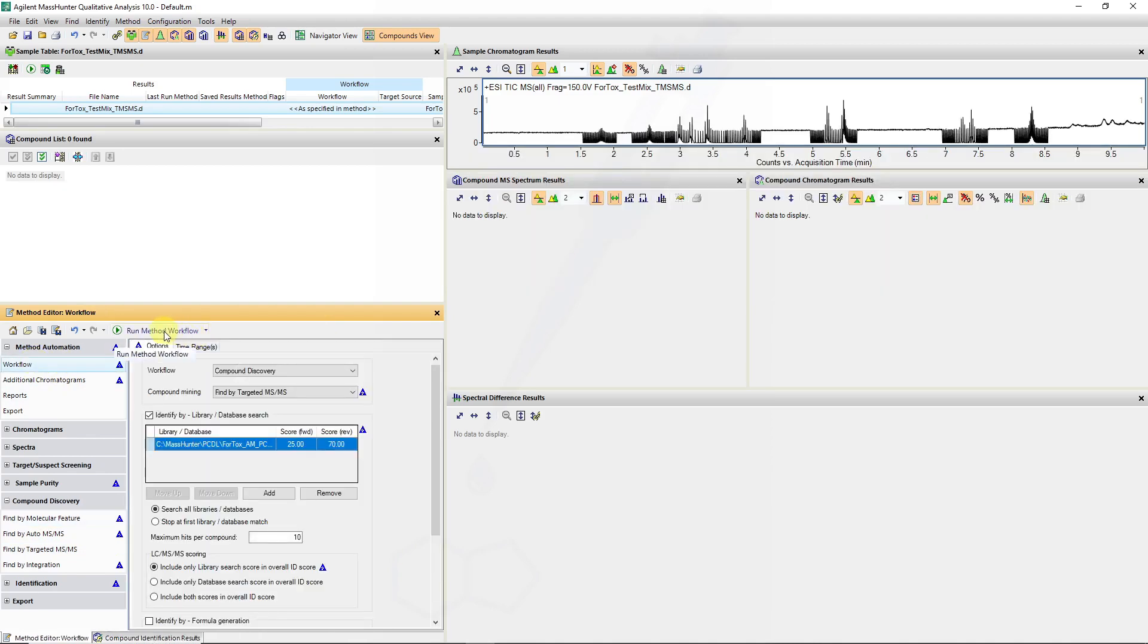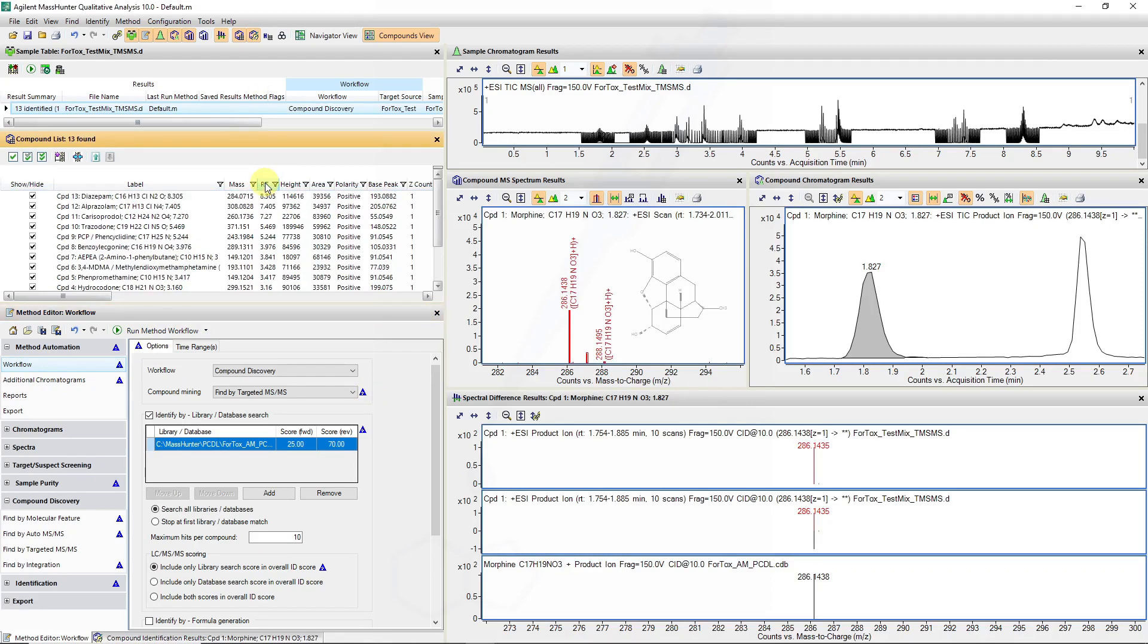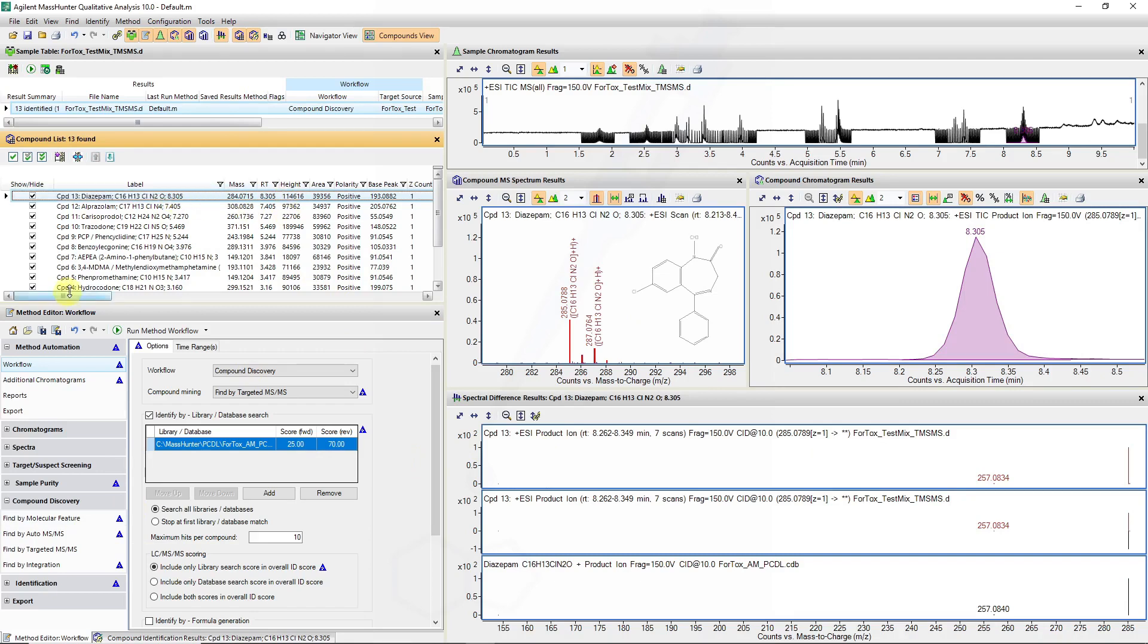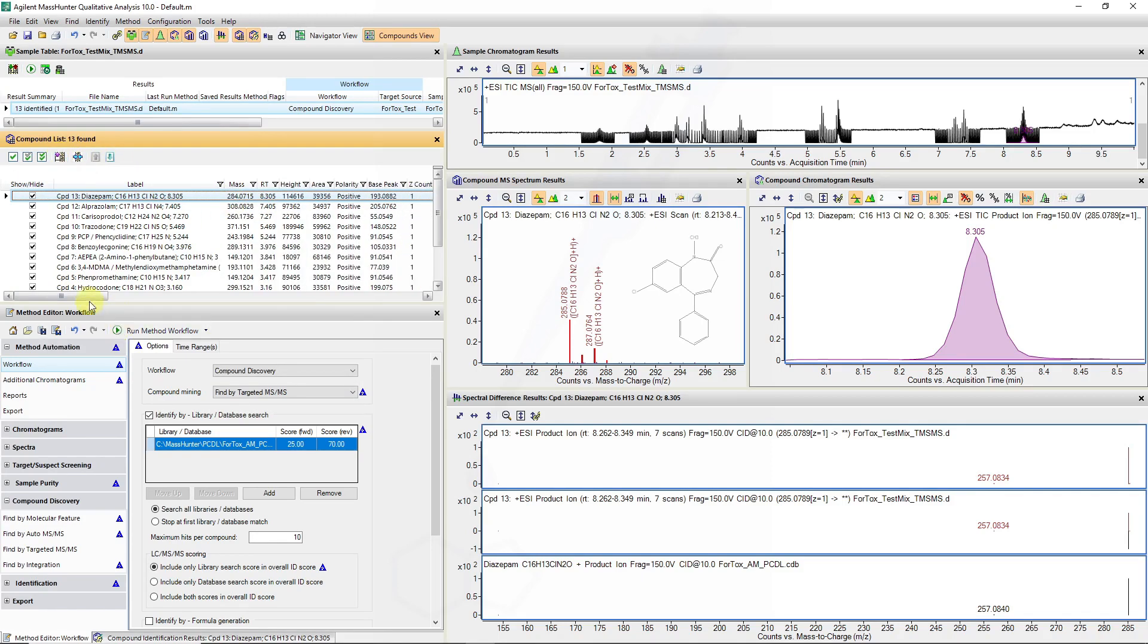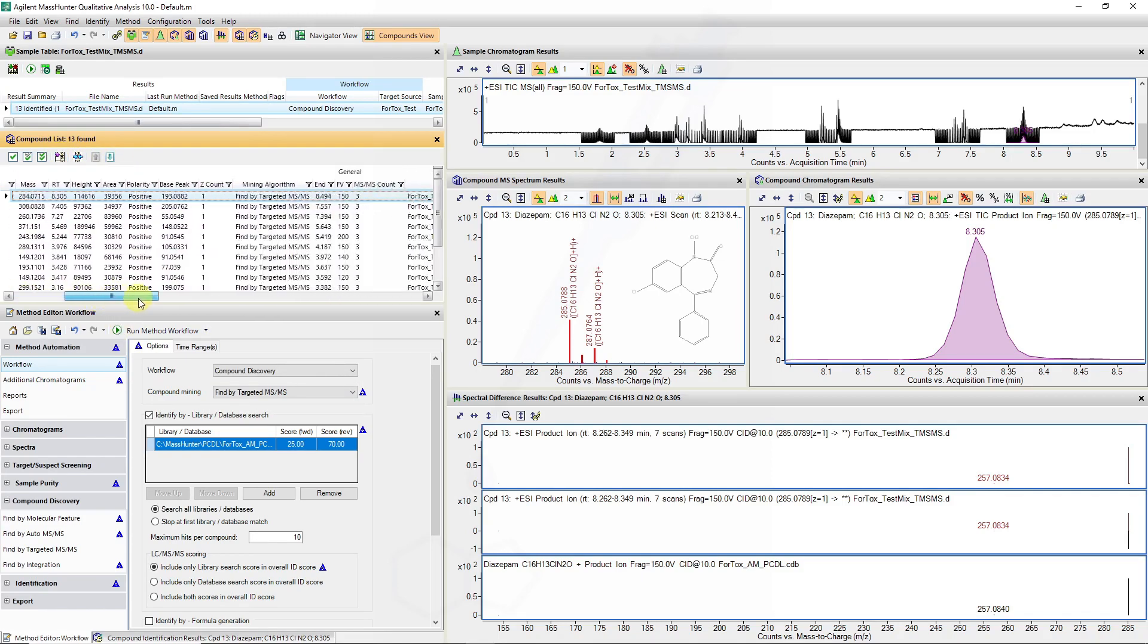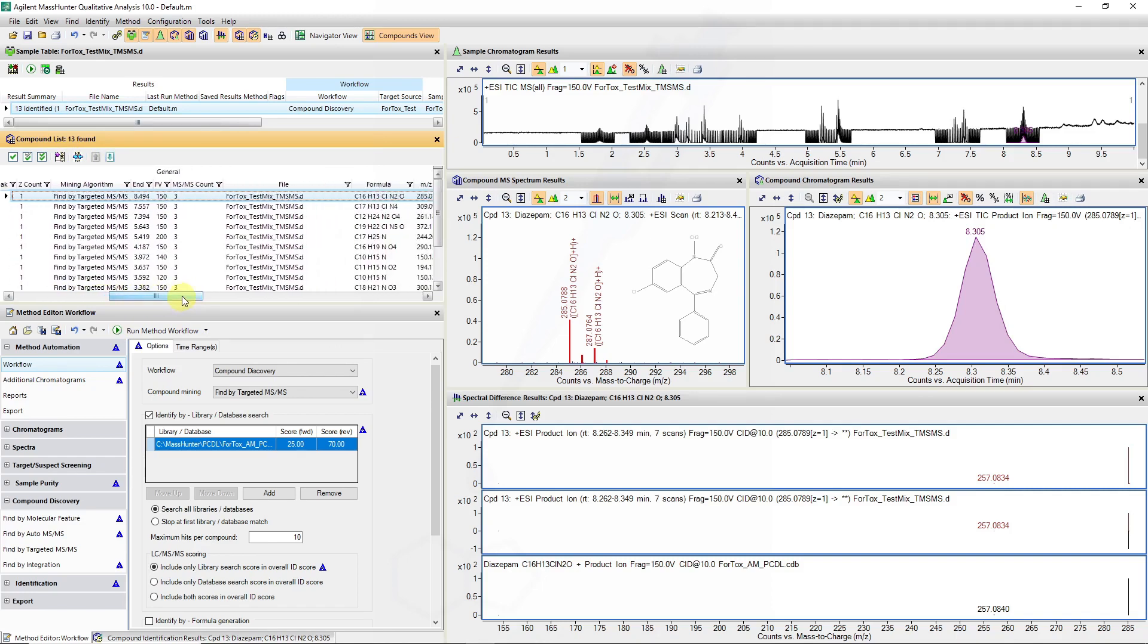I will rerun my workflow and in this case I'd like to verify the behavior of the program by going to my peak at 8.3 minutes where I know I have diazepam standard. In this case I can see there's a result and again we will add all the columns and remove any columns in our compound list. So here I can see that there's the MS-MS count.